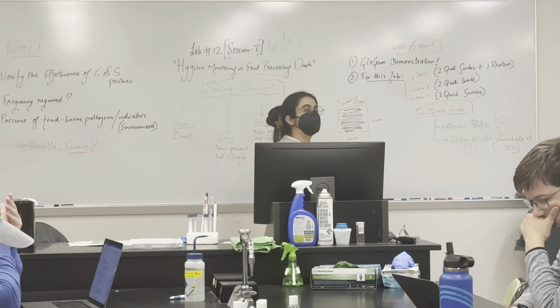For this, Bhashpati will be assisting you. If you have any questions in the dairy plant facility, you can ask her. Next part is the inoculation of these swabs into the aerobic petrifilms and coliform petrifilms. In each kit, there are 3 aerobic petrifilms and 3 coliform petrifilms. That part will be done in the biostress building in 057, which is our usual lab. Sheetal will be there to assist you with the petrifilm inoculation. Clear up to this point?